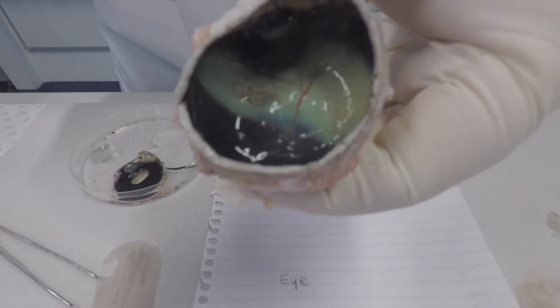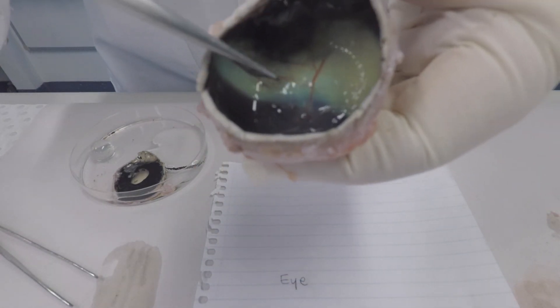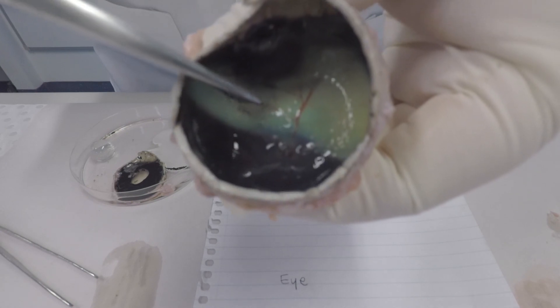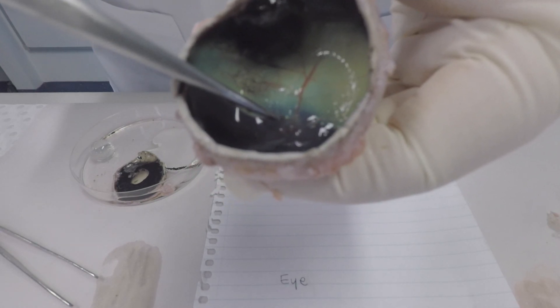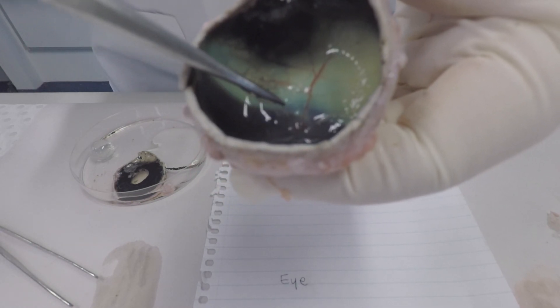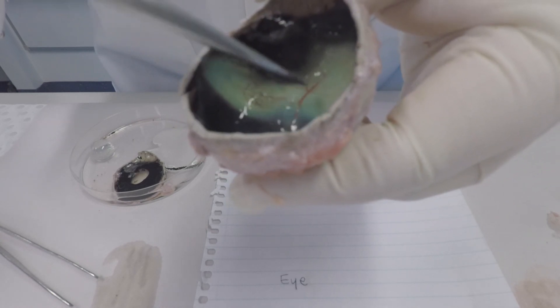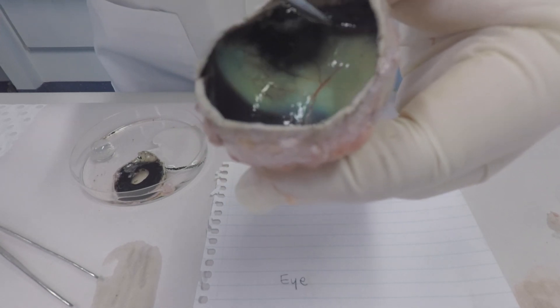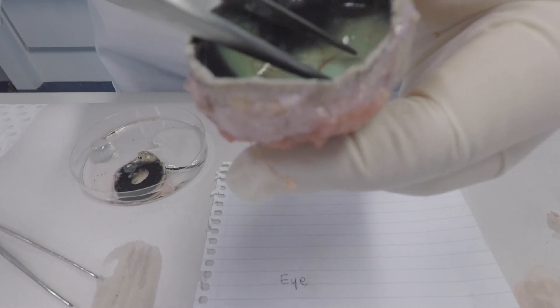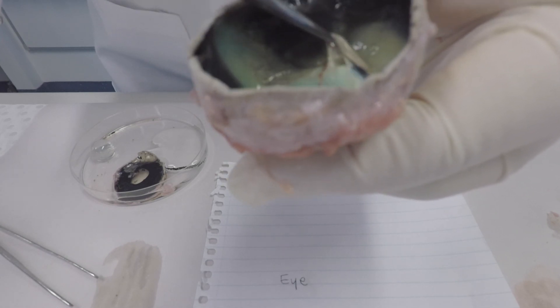We'll just have a quick look at the back of the eye. We've got the sclera, and then we've got the choroid, which is the bright green-aqua colored layer. We also have the retina, and we can see on top of that. I'll just take a bit apart and show you—there it is.